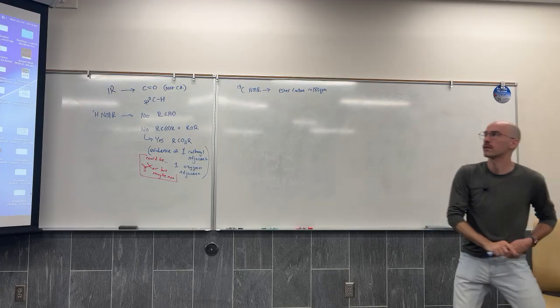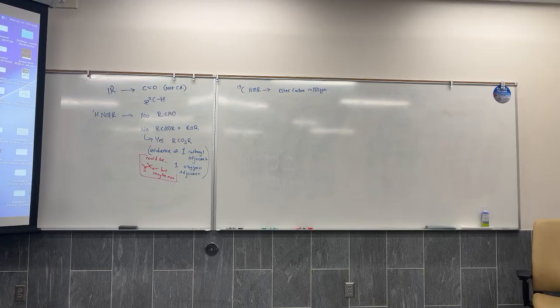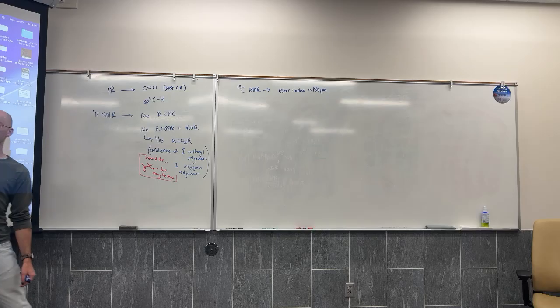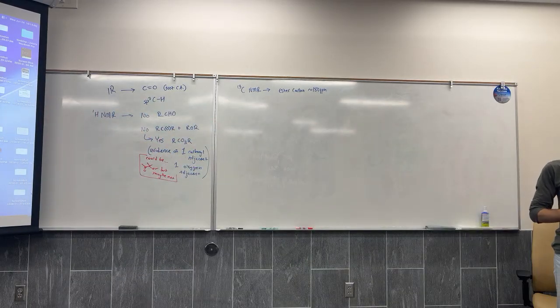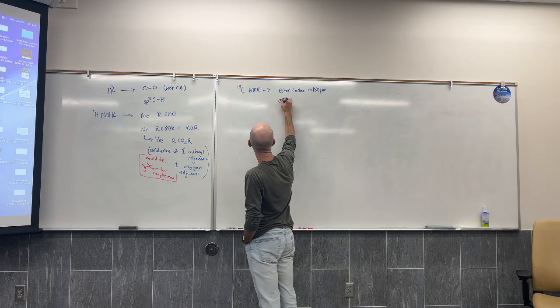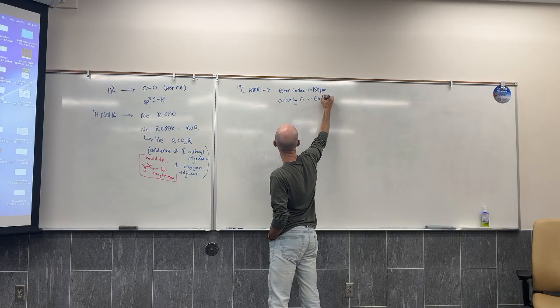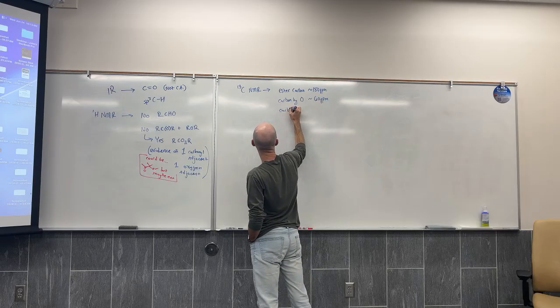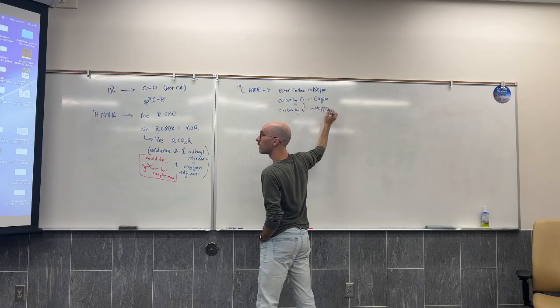Again, proton correlation table. Hydrogens closer to that heteroatom show up further left. Hydrogens closer to a carbonyl show up further right, which is why that structure is laid out the way that it is, as a reminder to you. So I think that this carbon NMR is actually confirming that I have carbon by an oxygen, and that's showing up around 60 ppm. And then I have a carbon by a carbonyl, and that's showing up around 40 ppm.